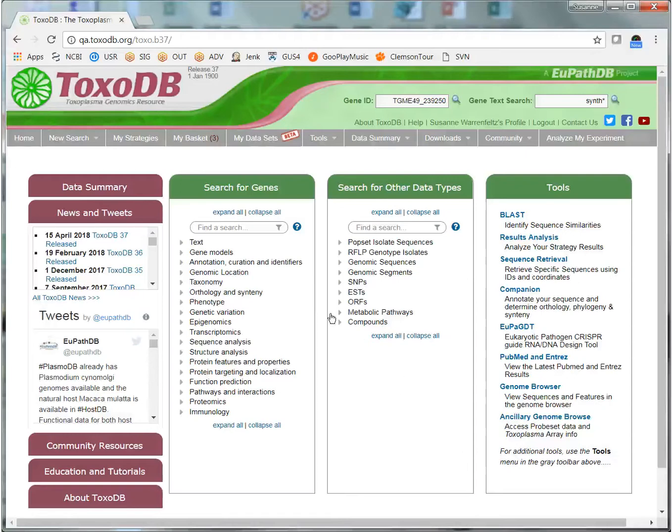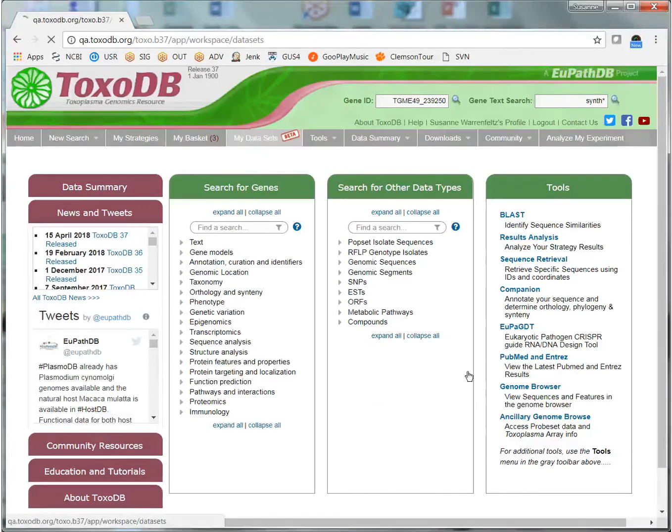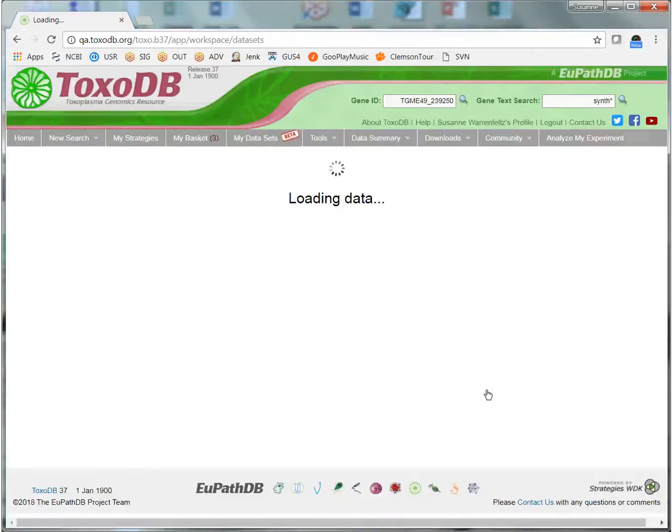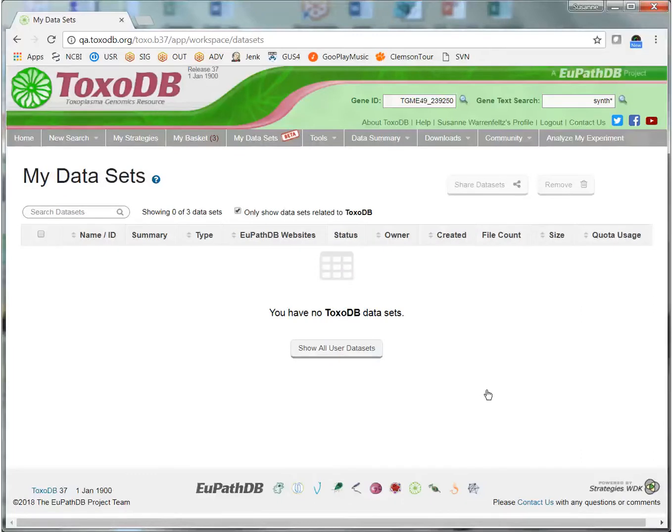So here we are in ToxoDB, but the tools and functions I will demonstrate are the same in any EuPathDB site. The My Datasets page is for accessing your private datasets. Your datasets can contain one or more files, and all files in the dataset must be associated with the same reference genome.